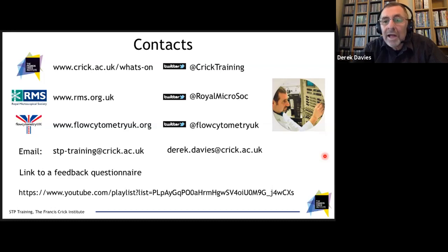Compensation beads are antibody capture beads. They're actually coated with an anti-kappa antibody, so they'll bind to the light chain of your antibody. So they're not binding the specific target. So we have to do titration with a cellular target. But it doesn't have to be with your particular cells. In fact, you should do it with a cell that's expressing as many of that target as possible. Quite often that's easy to find, because the data sheet may tell you which antigen this has been derived against. So you can do it in a cell line that may be expressing that marker.